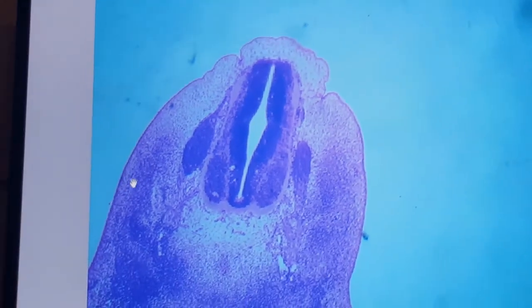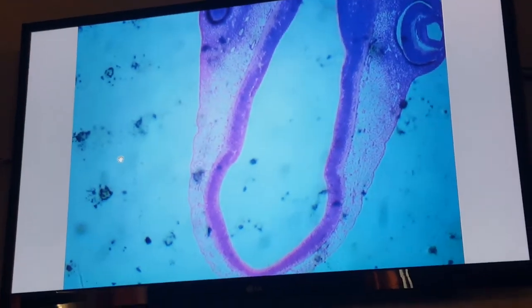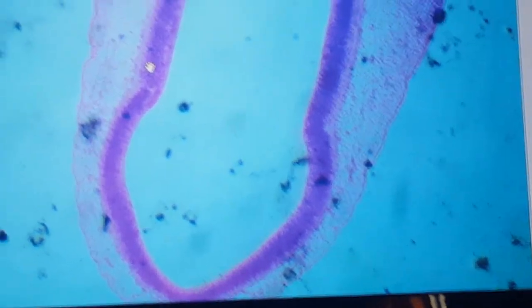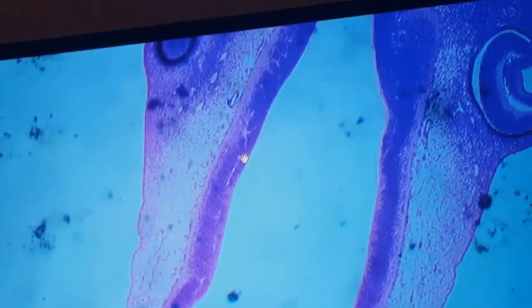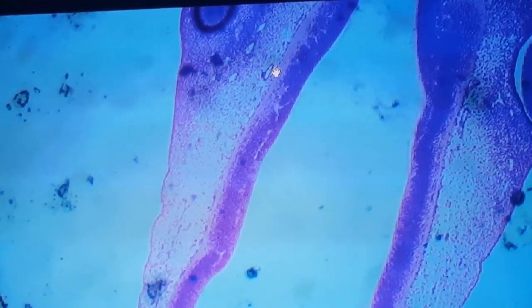Just look to the dermomyotome and sclerotome. I will pass to the other side of the section, and again, I will see the diencephalon because the other side shows the ventral limb of the U-shaped embryo. And also I have a neuroepithelium, mantle zone, and the pink marginal zone. The same will be seen whether in the spinal cord or in the neural tube. And later on, we will see more and more of these sections and more mature stages of the mantle and marginal zone.